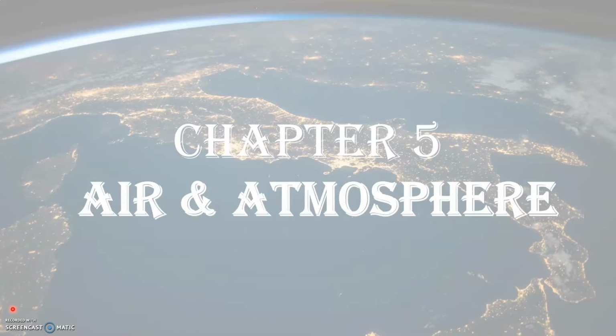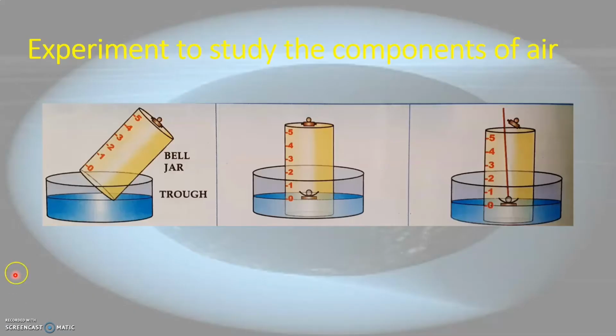In order to do this activity, as you see here in this picture, we need a bell jar with 5 equal divisions that are marked on it. We also need a trough that contains water. Then we need a crucible that contains phosphorus and also a cork.